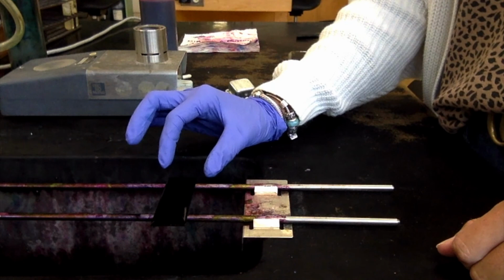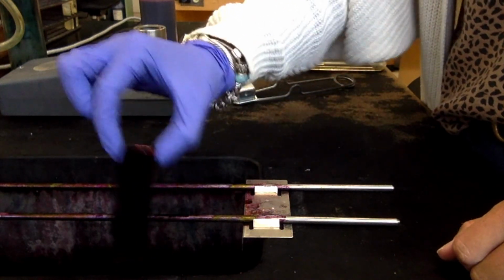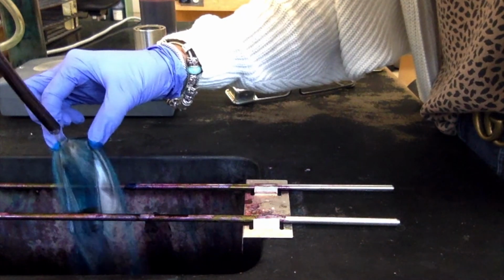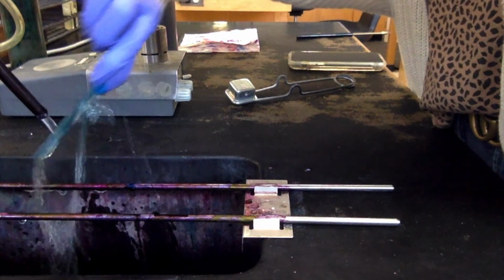Alright, so I have heated it for 5 minutes. I've let it cool for 2. So now we are going to rinse it with the decolorizer. So the decolorizer in the spore stain is water. So we're going to just simply take this off. Now this is going to take a little while to rinse because you have just cooked this malachite green onto this slide. And again, you want to rinse till the water runs clear.